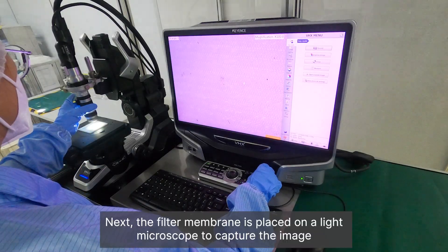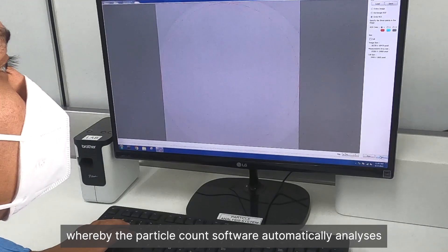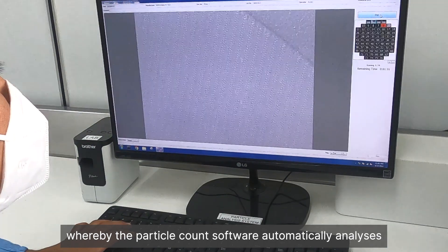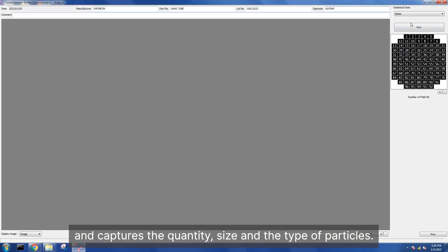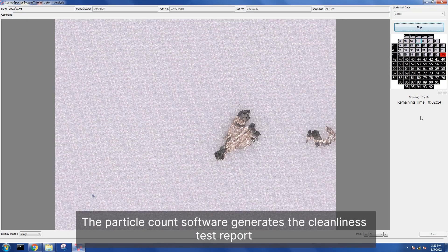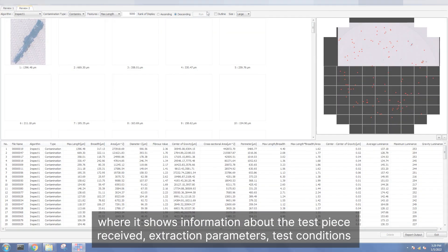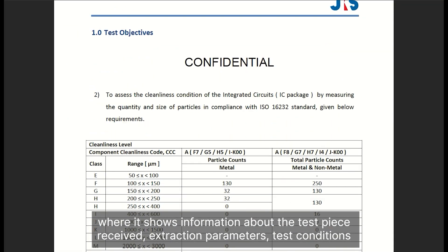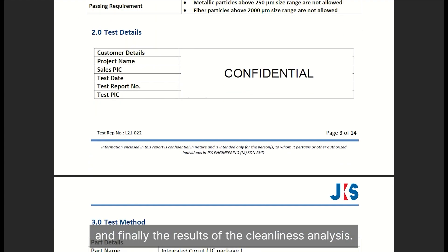Next, the filter membrane is placed on a light microscope to capture the image, whereby the particle count software automatically analyzes and captures the quantity, size, and type of particles. The particle count software generates the cleanliness test report, which shows information about the test piece received, extraction parameters, test conditions, and the results of the cleanliness analysis.